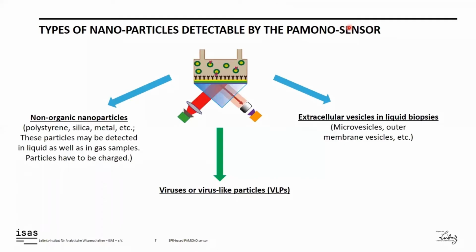And now I would like to demonstrate the movie with an image sequence of 200 nanometer polystyrene particles recorded during PAMONO-sensor detection.